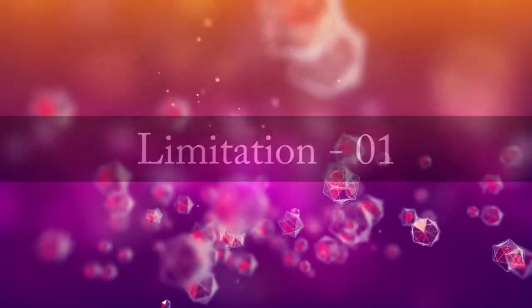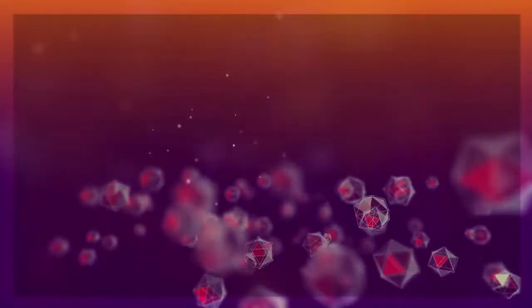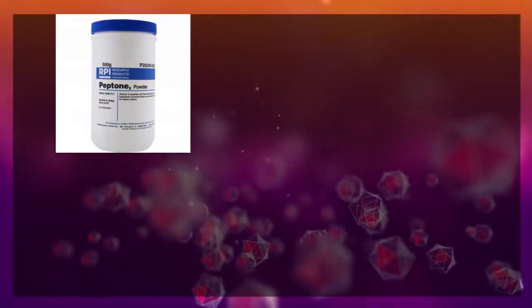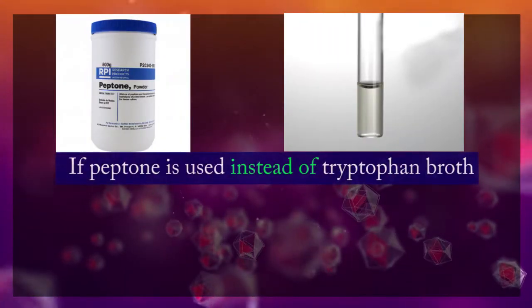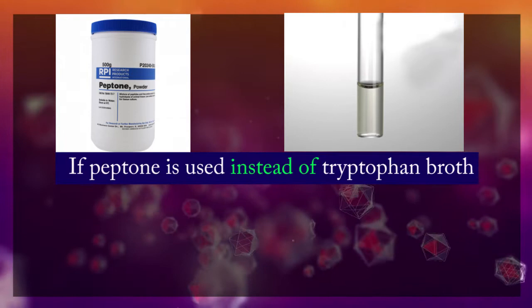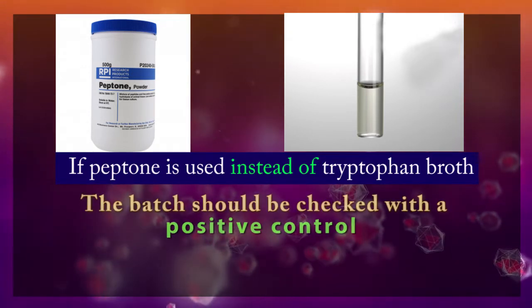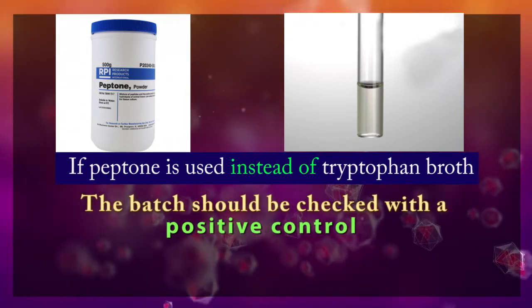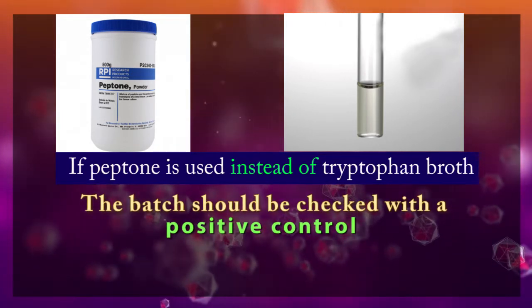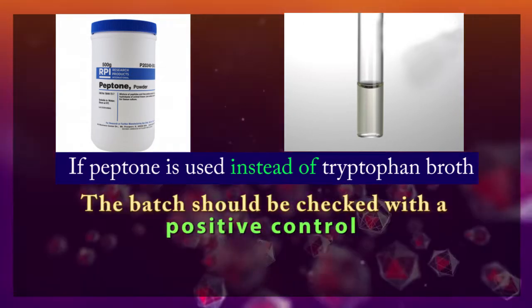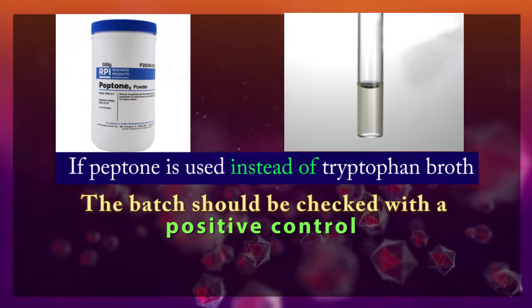If peptone is used instead of tryptophan broth, the batch should be checked with a positive control to ensure the peptone is adequate for indole production.